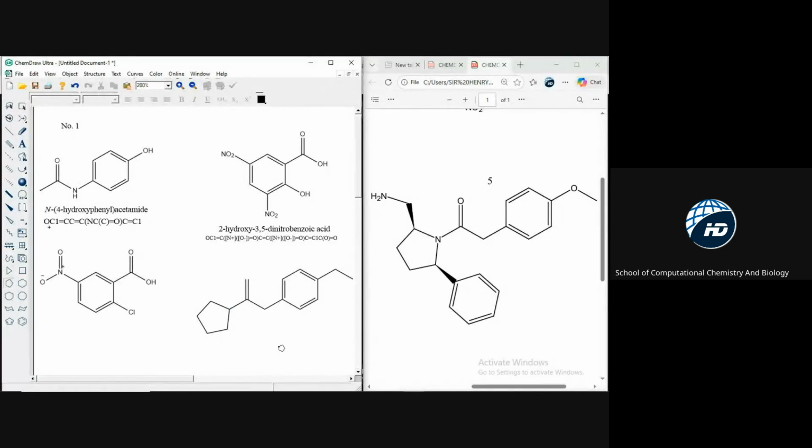Okay. So at this point now, I've added it. For now, I'm not putting the atoms yet. I'm just putting all the bonds. So that will now edit the atoms. There is a single bond here, so I pick up my single bond. There is a single bond here. There is a single bond here. So this single bond is pointing like this. Meanwhile, it's supposed to point this way. So I can keep it like this. I can decide the direction.